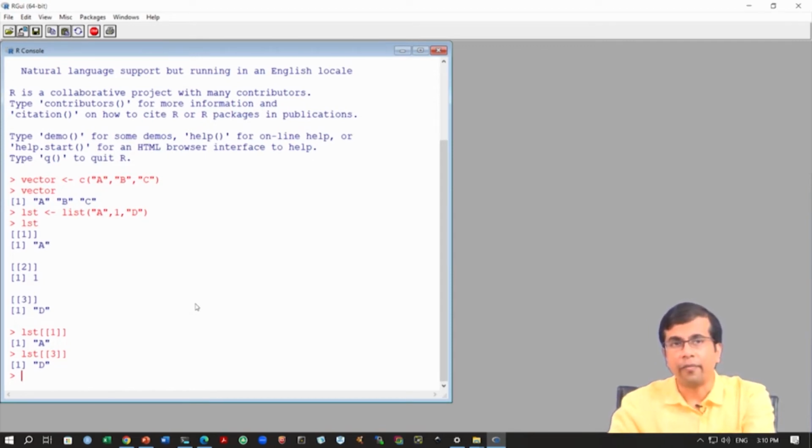You can also define a matrix in R. This is the type of data that we will encounter most. We will work mostly with matrix data because we are talking about count data in transcriptomic data. Count data means we have genes in the rows and samples in the columns. So, this will be a matrix, where the dimensions are determined by the number of genes and the number of samples. We will come to that in a moment when you actually start working with the read data.